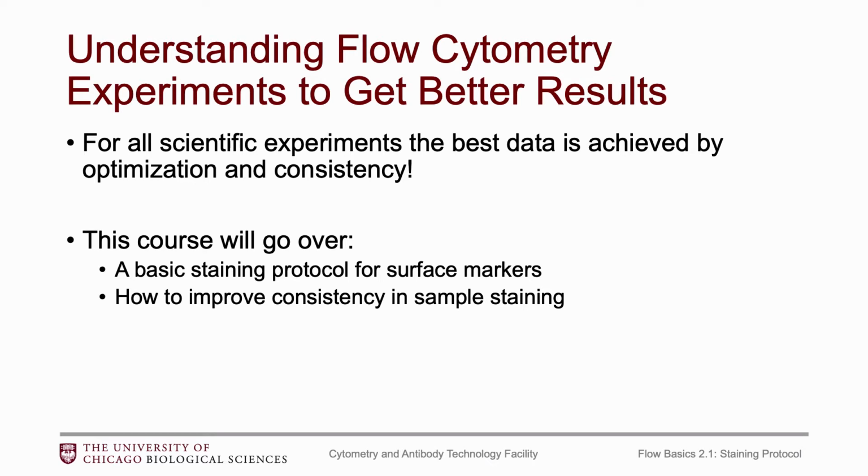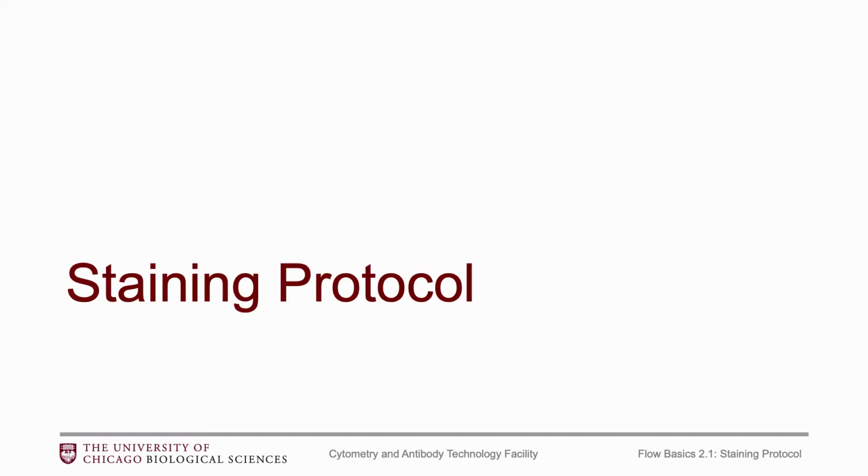So as I mentioned, I'm going to talk about a basic protocol for this video, mainly intended for those of you who have little to no experience staining. I'm just going to talk about surface markers here. And again, the overall theme of this is how to improve consistency in your sample staining. So let's get to it.